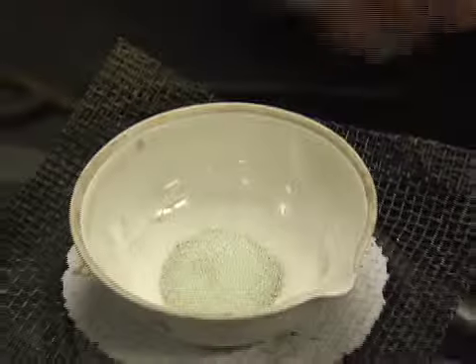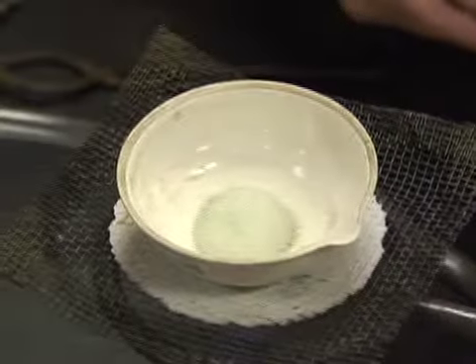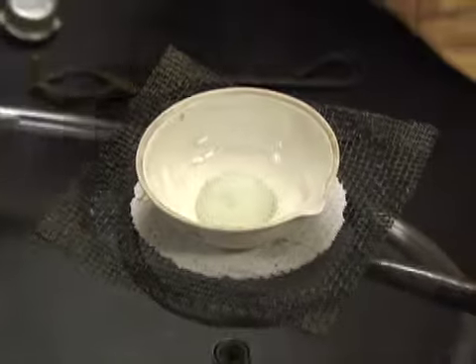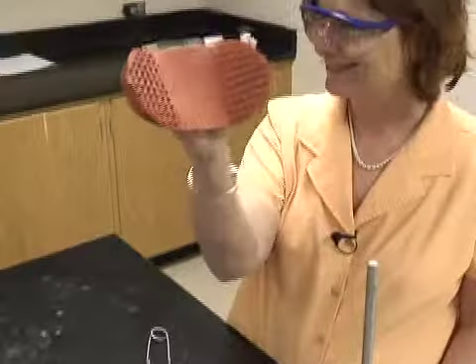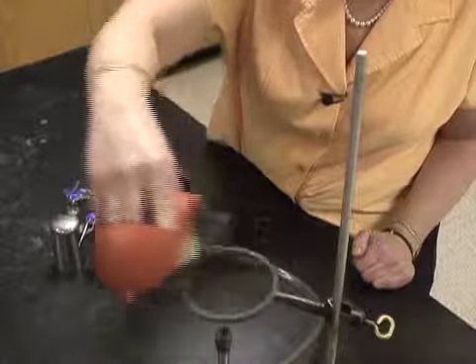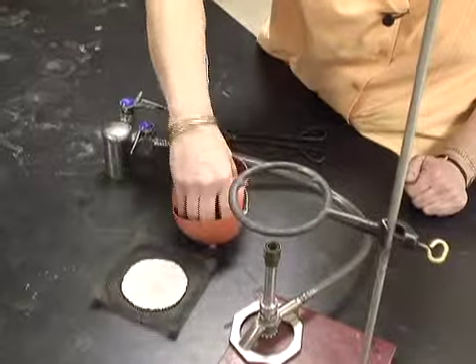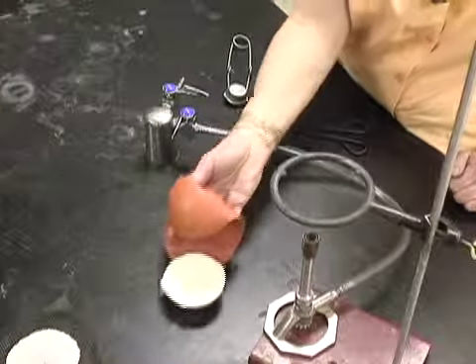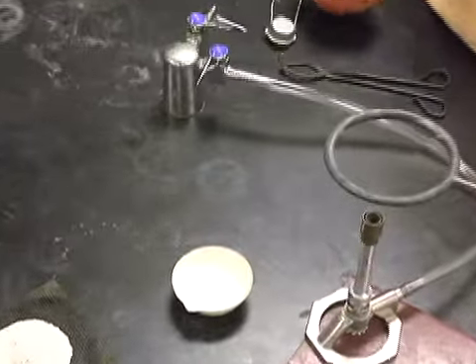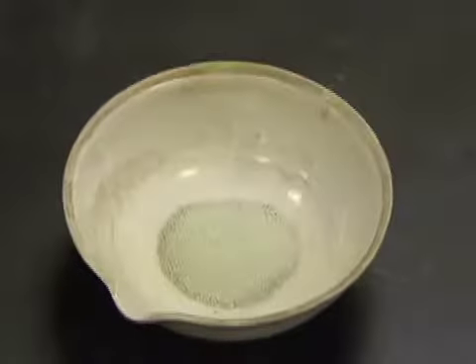I just get so nervous. I'm like, I don't know, should I take it off? Should I not take it off? Well, I suppose we'll go ahead and take it off. So I'll turn off the gas, and I can use my fancy hot hands. They almost look like they're going to talk to you. And I take it off, and I can set it on the lab station. Oh my, I got that wire gauze as well. But that's okay because these lab stations are made to handle hot items. I'll just let it sit, and we'll let that cool down, and I'll see you at the scales.